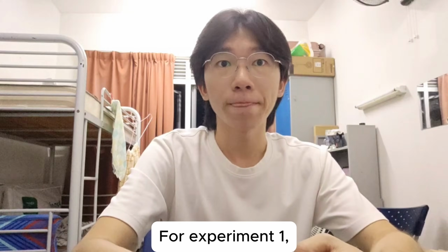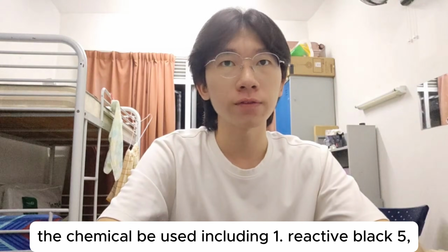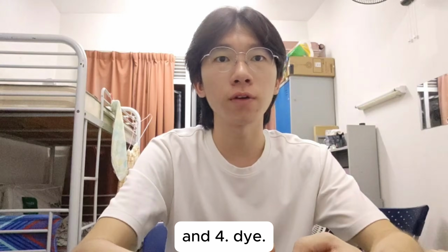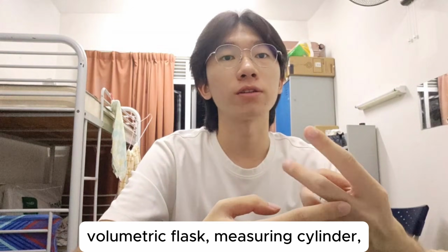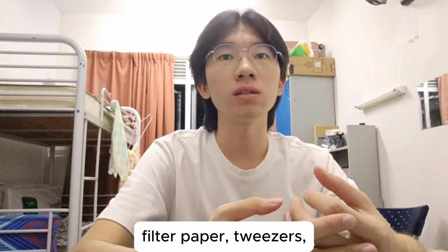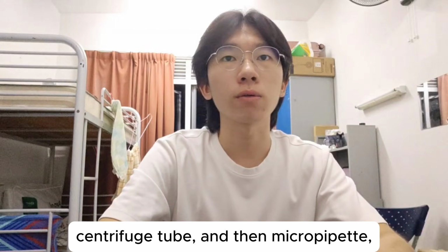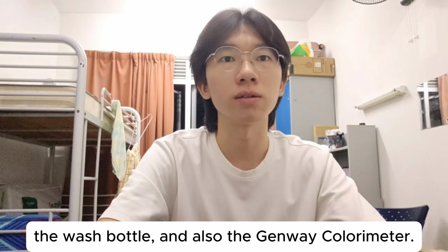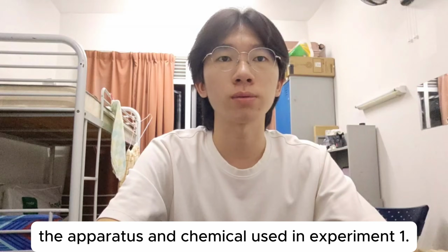For experiment 1, the chemicals we use include first, Reactive Black 5, second, distilled water, third, the industrial wastewater sample, and the fourth is the dye. And then the apparatus we use includes beaker, volumetric flask, measuring cylinder, filter funnel, filter paper, tweezer, centrifuge tube, and then the micropipette, the wash bottle, and also the Janeway colorimeter. So that's all for the apparatus and chemicals used in experiment 1.